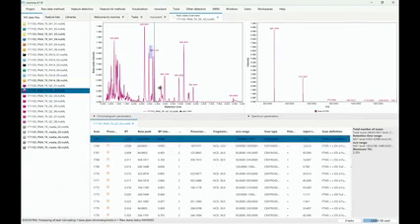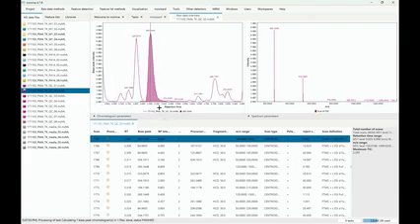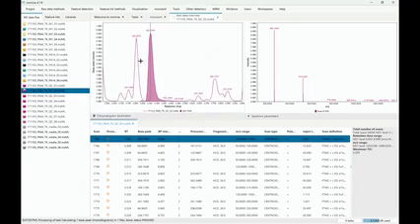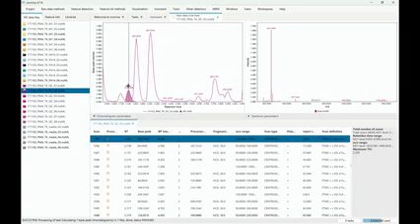And in the raw data overview, we try to make it interactive so that you can have the chromatograms on the side. It's typically configured to be a base peak chromatogram, so the highest intensity signal is going to define the shape of this chromatogram. You could also change it to TIC here down in the settings, but honestly, typically either one is fine for just exploring your data.